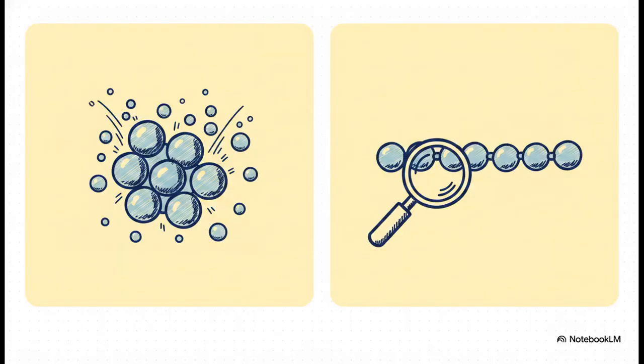Which brings us to part 3, the catalase crossroads, branching the investigation. All right, so we've hit a diagnostic crossroads. Seeing those gram-positive cocci in chains is awesome, but we have to make absolutely sure we aren't chasing the wrong suspect entirely. Enter the beautifully simple catalase test. We literally just apply hydrogen peroxide to our bacteria. If it vigorously bubbles, well, they produce catalase, like Staphylococcus, which, by the way, forms grape-like clusters under the microscope, not chains. But if our test is catalase negative, so no bubbles at all, and we're seeing those characteristic chains, we have successfully cornered the Streptococcus genus. Just like that, we've narrowed our suspect pool down massively.